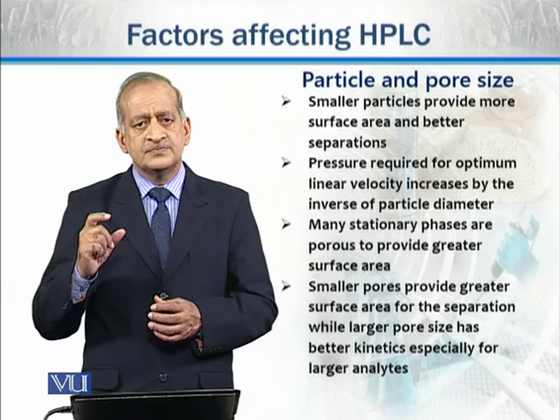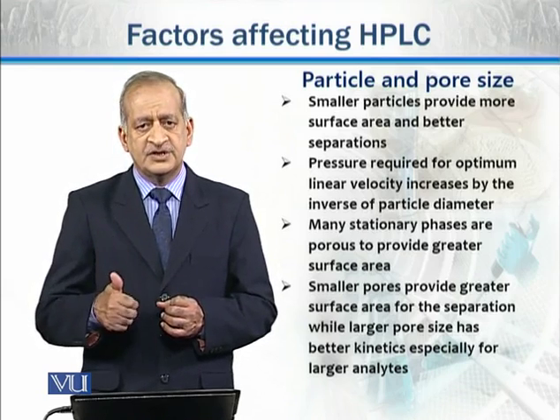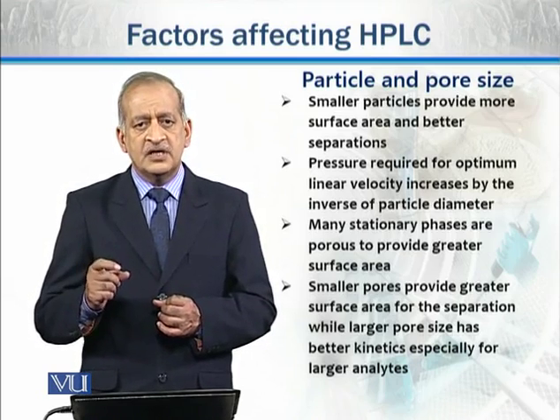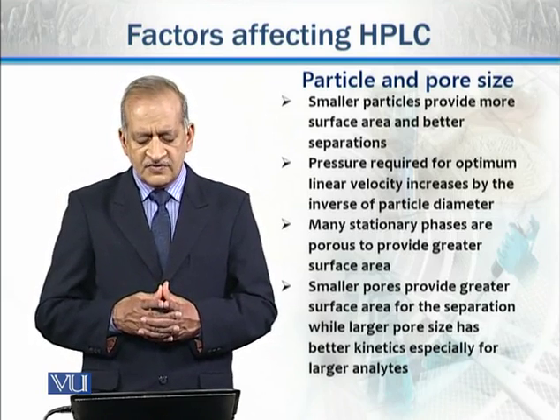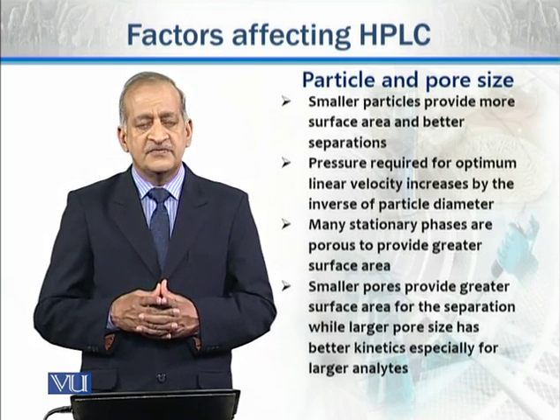So अगर particle का size छोटा हो, we have to apply more pressure ताकि separation बेहतर तरह से हो सके. अगर particle का size बड़ा हो, तो pressure की जो requirement होती है वो कम होती है. Many stationary phases are porous to provide greater surface area.